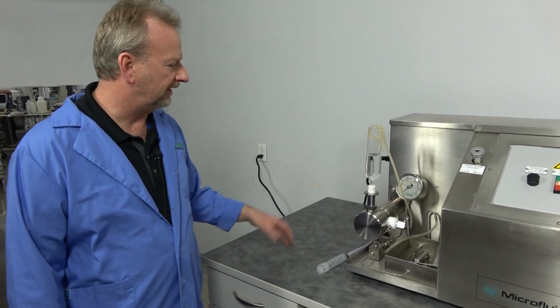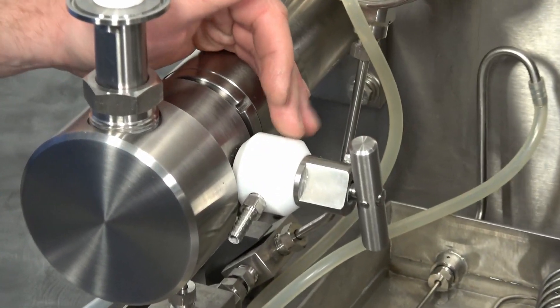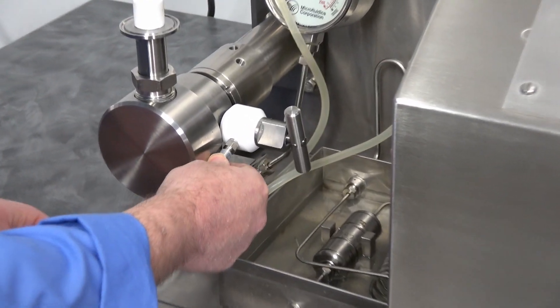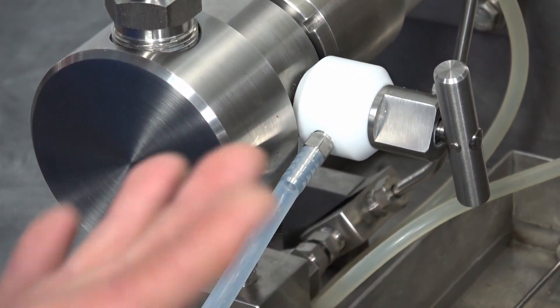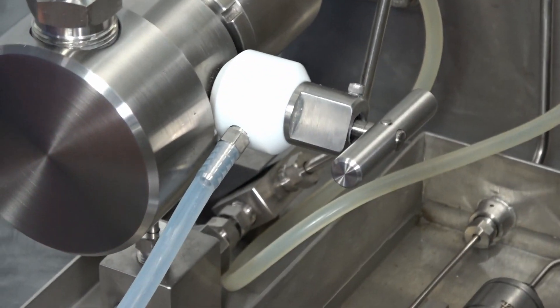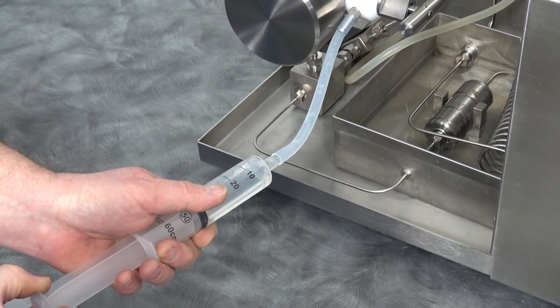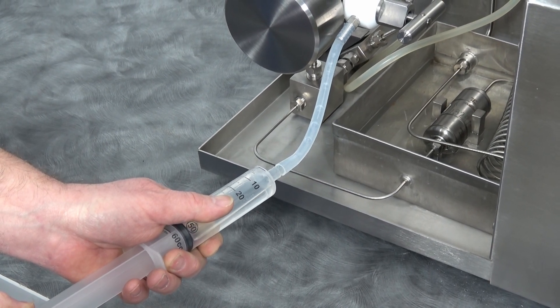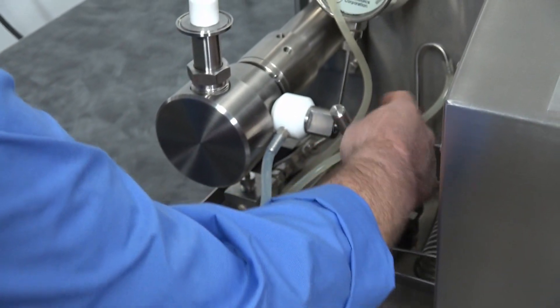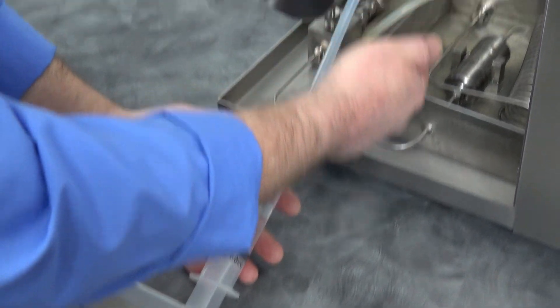I'm going to go over how you would proceed with this. This particular model has the bleeder valve on the side, which is really nice. Just get a syringe — you can use a bigger one depending on how much air you need to remove — and plug it in. You don't even need to start the machine yet. Open up your valve all the way until it stops, then just pull back and you can see the air bubbles coming out, which is what we want. Pull all the air bubbles out of the system, and once you've got a full syringe, shut the valve again.